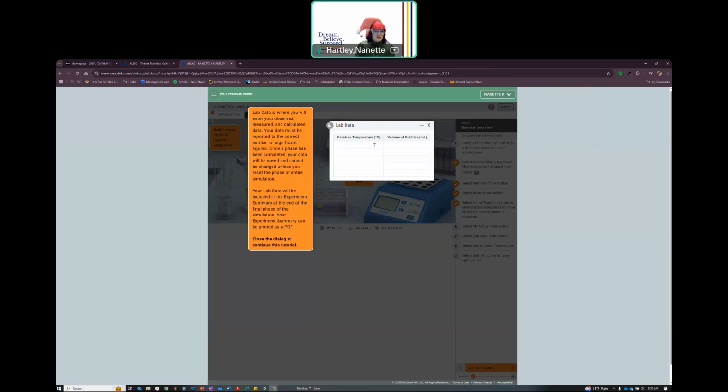If you make a mistake in it, you're supposed to write a single line through it, initial it, and date it to indicate that you made a mistake. Yes, you can still read whatever that mistake was. So you still can see that data because you might actually not have made a mistake. You think you made a mistake, but you may not have. So you might need that data again. So you don't want to obliterate it. You don't want to white it out. You need to be able to read it again in case you actually needed it.